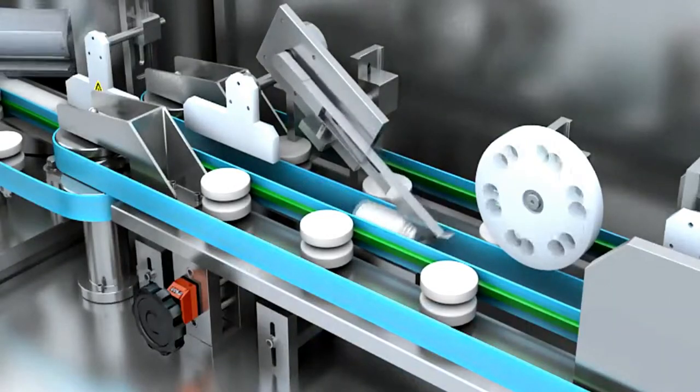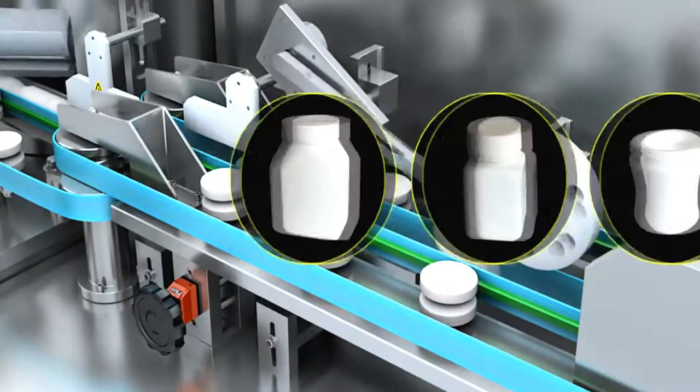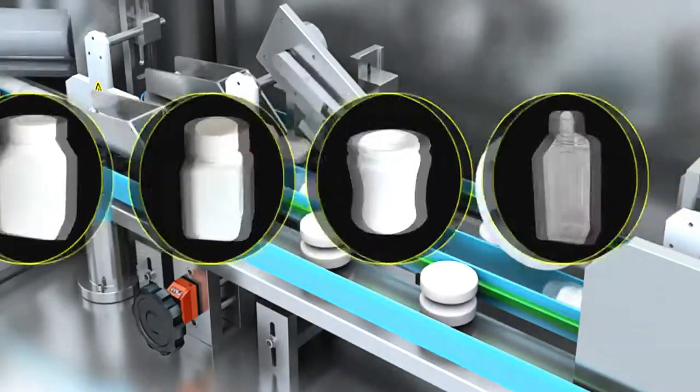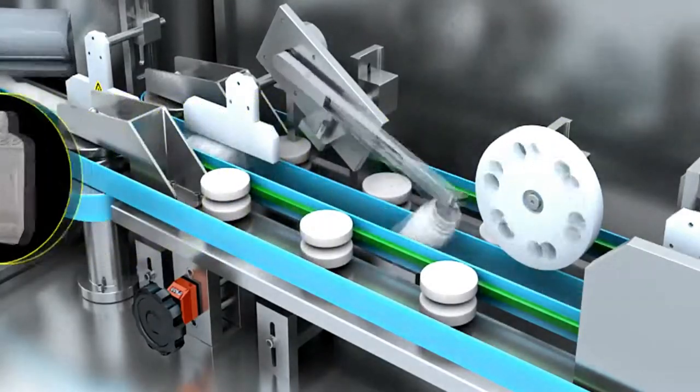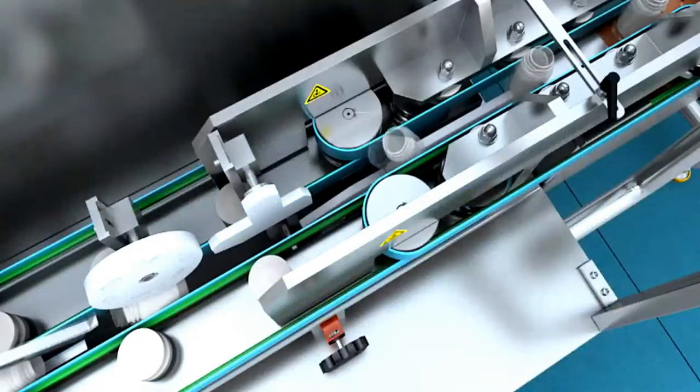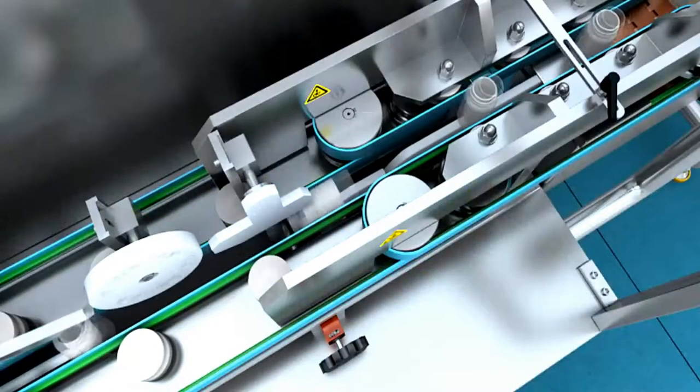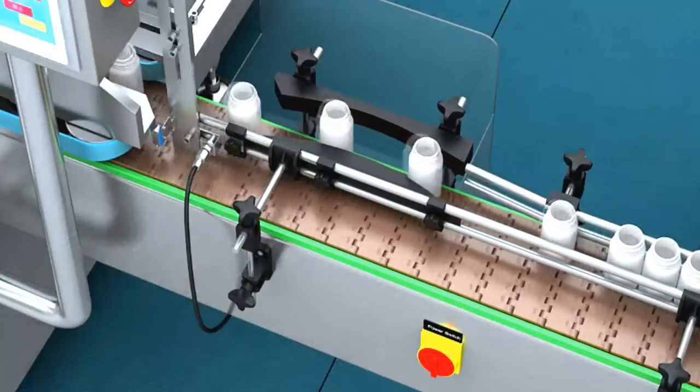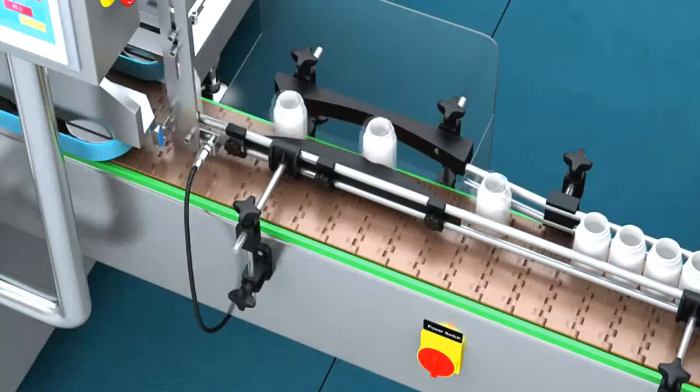You just need to do simple adjustments when changing specifications. It's suitable for arranging shaped bottles such as round bottle, square bottle, flat bottle, oval bottle, and more.